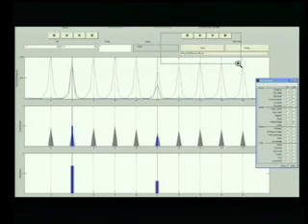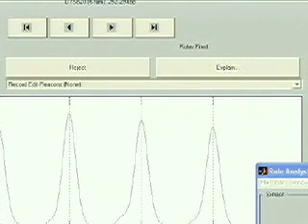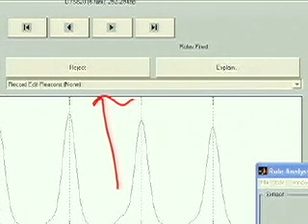Another area I'd like to focus you on is the area for the reject and the rules fired explain area. If I want to reject the sample, I can click that button. If I want to edit for some reason, I can actually edit the allele call, and then I can provide a reason. These reasons that are in the drop-down menu are reasons that you have provided to Cybergenetics that you commonly encounter when reviewing data.